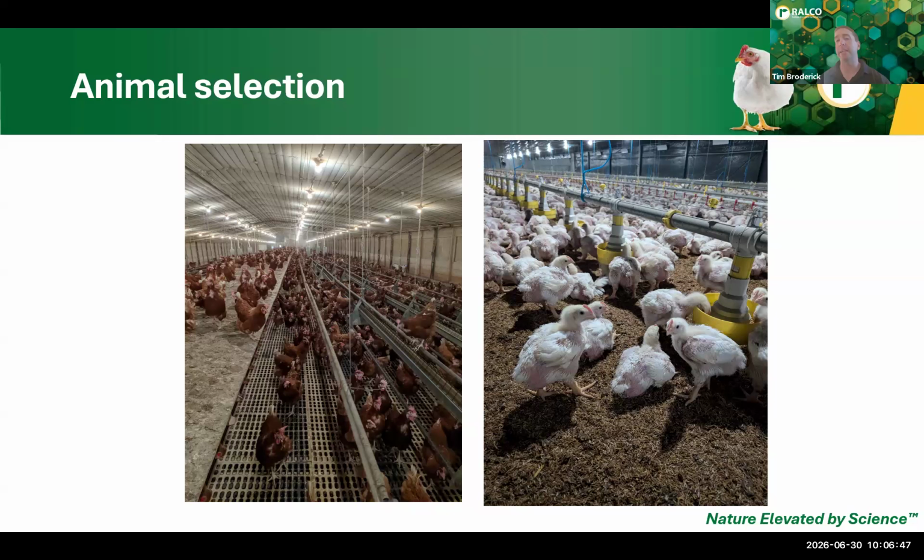That said, especially when we see a challenge where we know we're searching for some type of discrepancy in performance or health, we want to make sure that we get a representative selection. Those largely include any mortalities, preferably that morning or that day, but definitely within 24 hours. If on the longer side of 24, we want to have those carcasses refrigerated so that we can look at fresh mortalities without any extra decomposition.